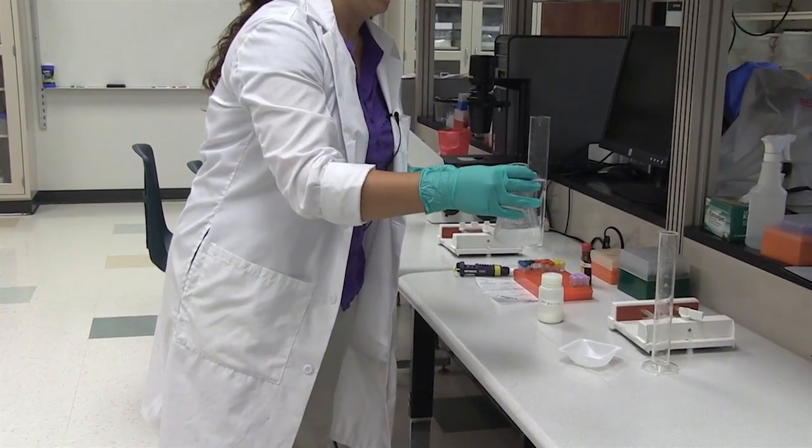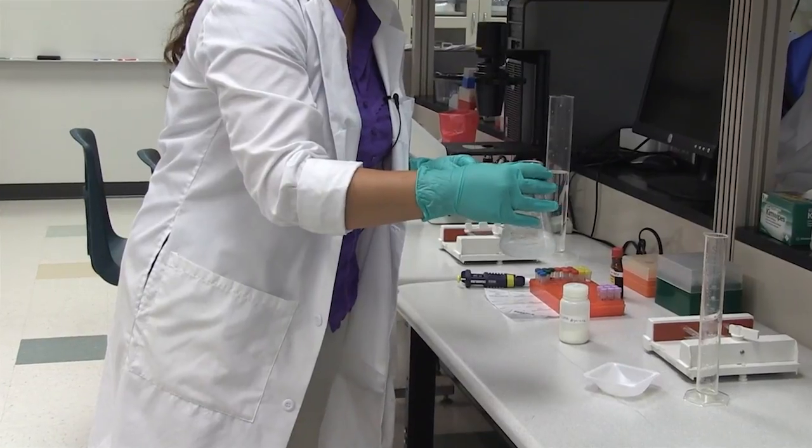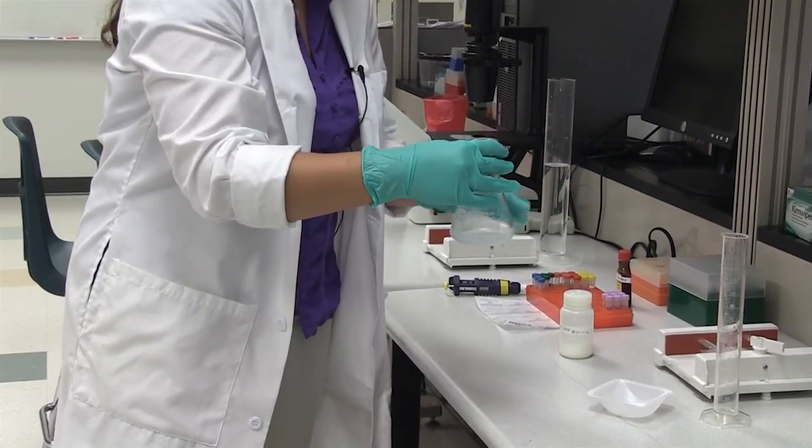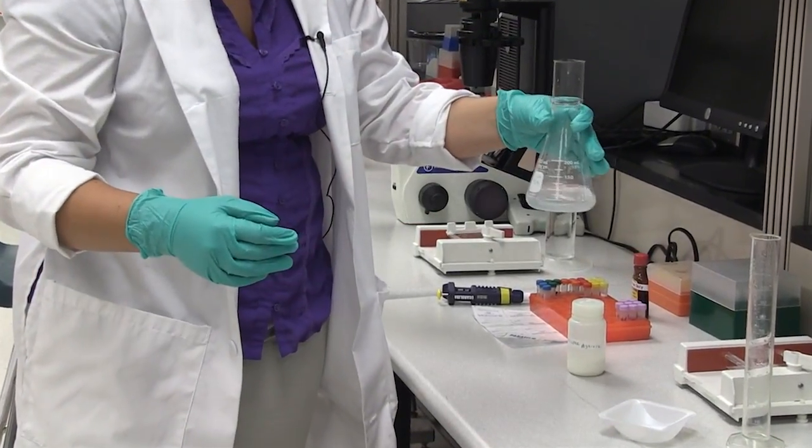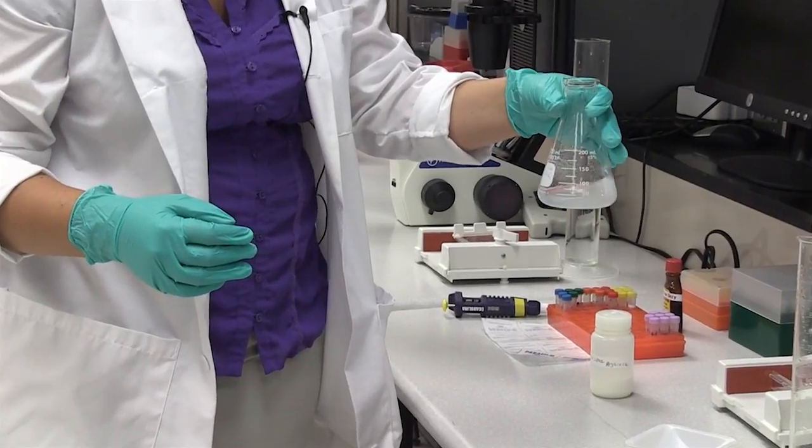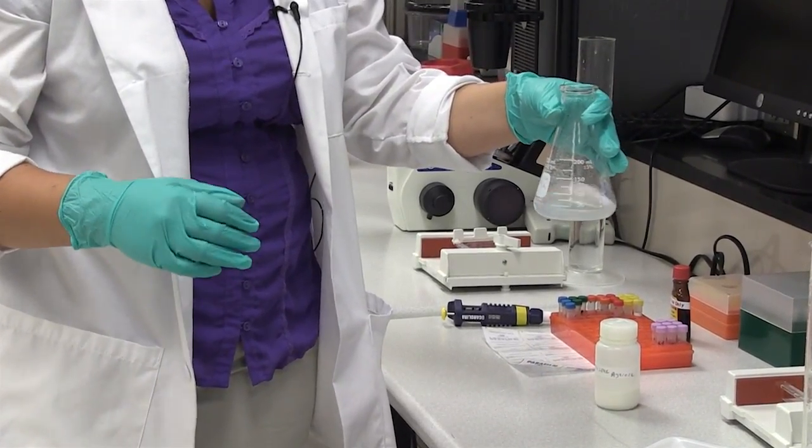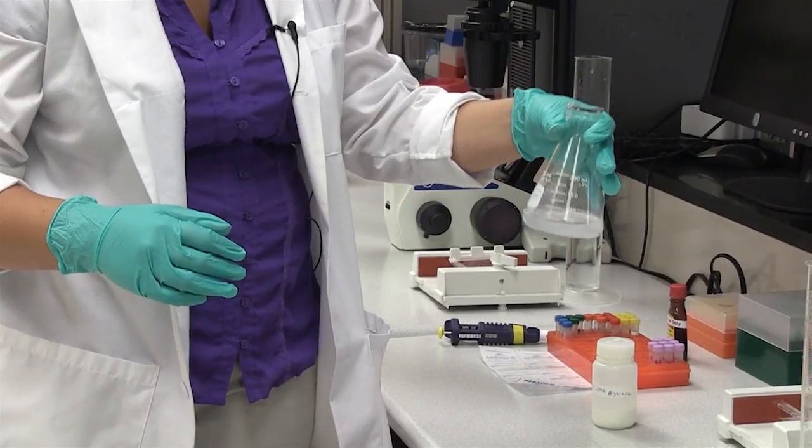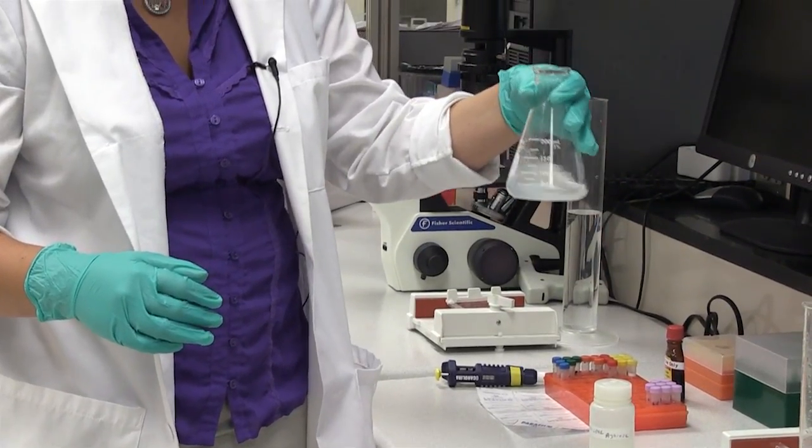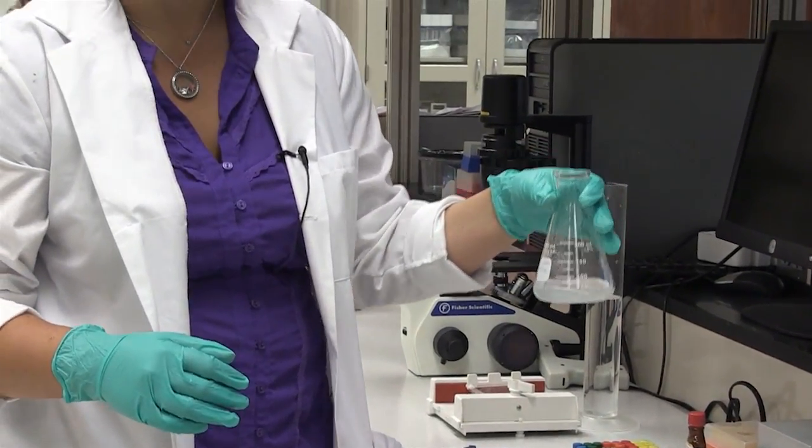Now that we have combined the agarose and the buffer we need to let it hydrate for about a minute at room temperature and then we're going to take it over to the microwave, add heat, swirl it twice during the minute time that it is being microwaved and we will have a nice clear agarose that's ready to pour.